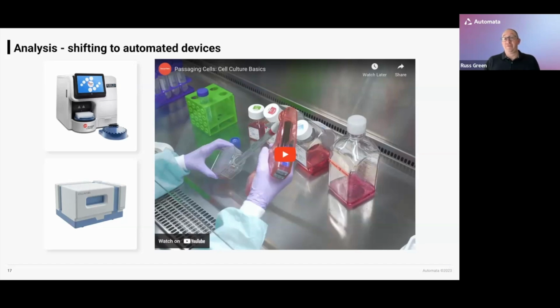But there are other devices that will work at a much higher magnification, or perhaps there are other kinds of analysis that need to be done, such as flow cytometry or something like that. Now there are also plenty of automated devices out there that will work around microplate-based labware, which is why that shift to different kinds of labware becomes increasingly important, because now my pool of analytical devices goes up extraordinarily.